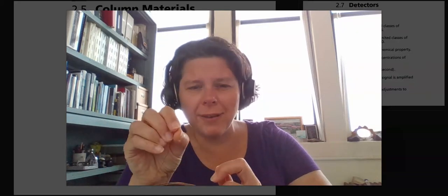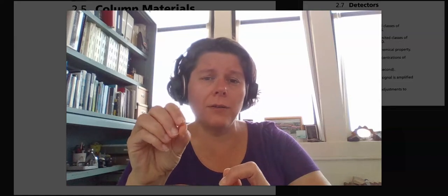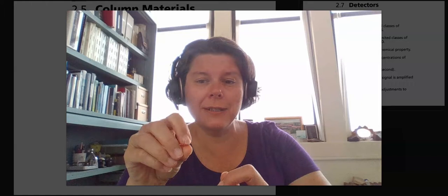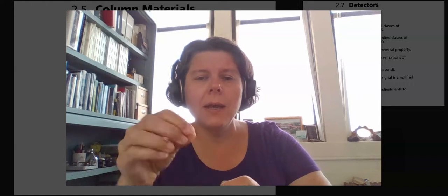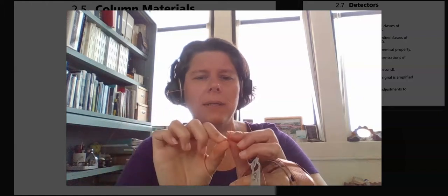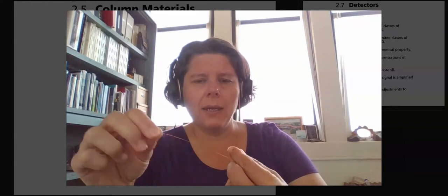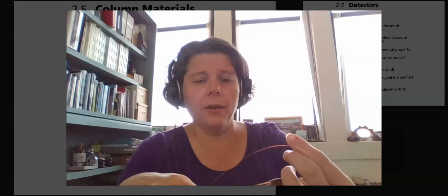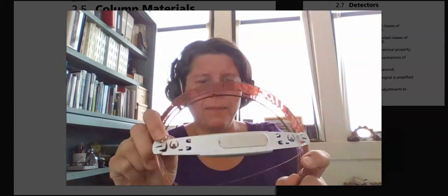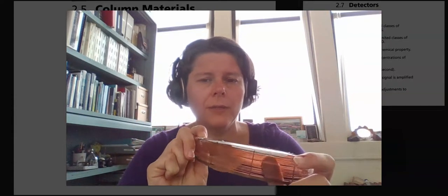And there's actually, you can't see it in here, but there's a little teeny hole on the inside of it. Just imagine if your hair was hollow instead of being solid. There's just this little teeny hole on the inside of this. This is glass. It's a flexible glass, as you can see. I can bend it. It's very thin in here. The column itself wraps around here, and there's a whole bunch of lengths of it. This is just one column itself.